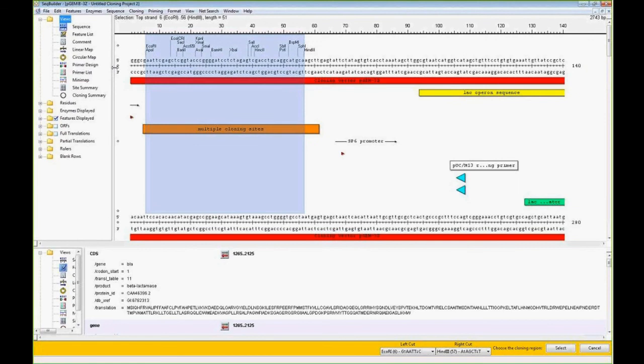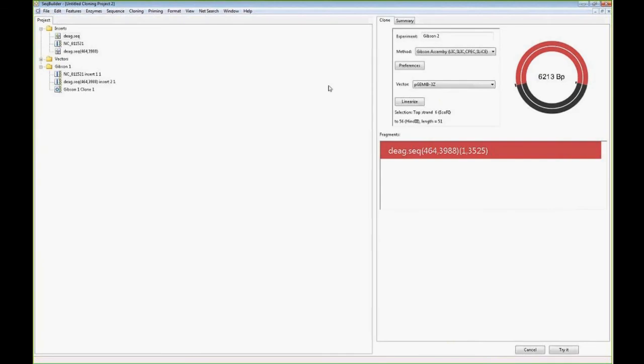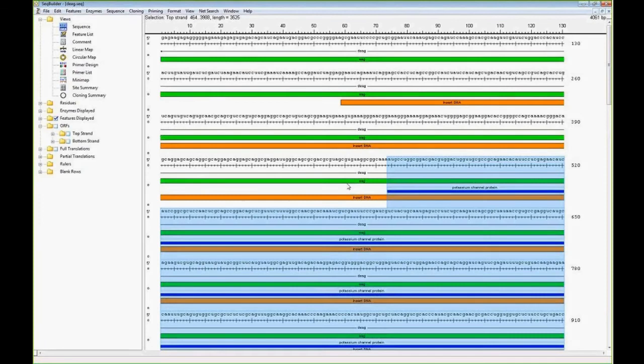Okay. All right. Cool. Yeah, thanks for the questions. So let's just go back to that original file, and what we're going to do is just do a GeneArt automated cloning project without all the talking.